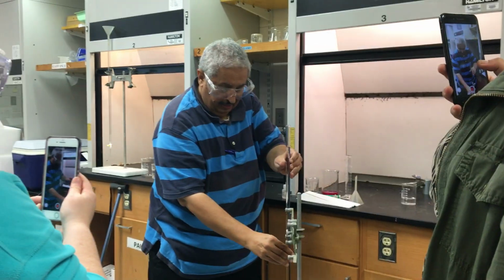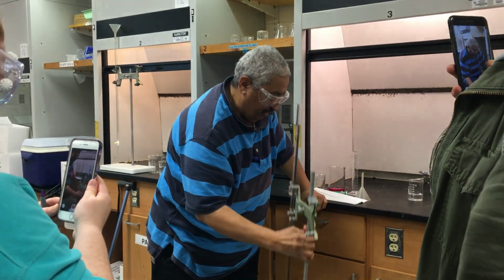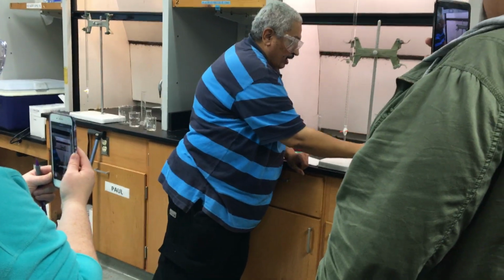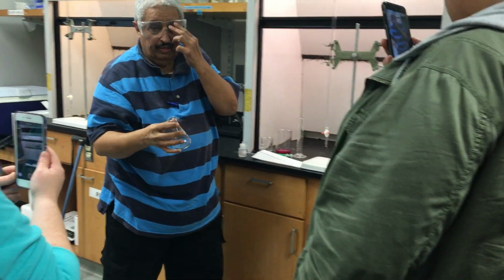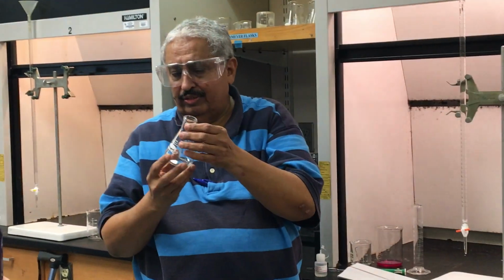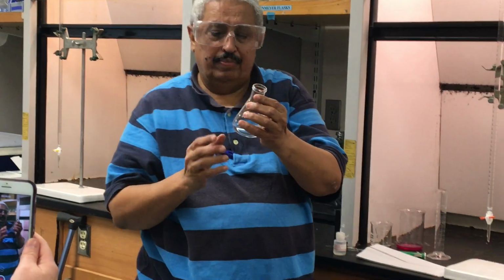So this is up. Time to go here up, so I can titrate now. Save. Take my funnel aside. In this flask here, that's the Erlenmeyer flask, I call it the titrating flask here. All the titration process will come into this one.